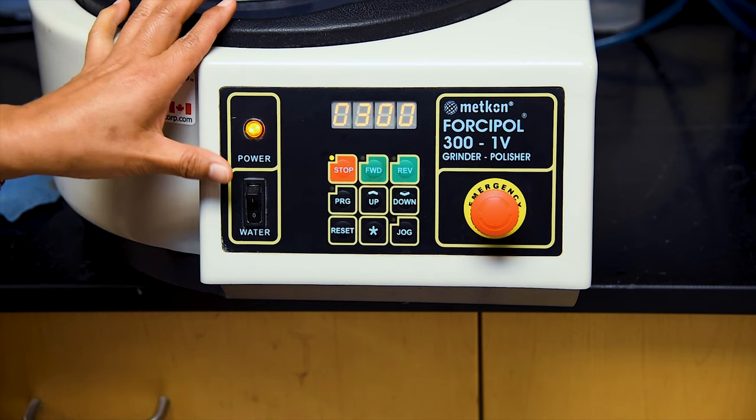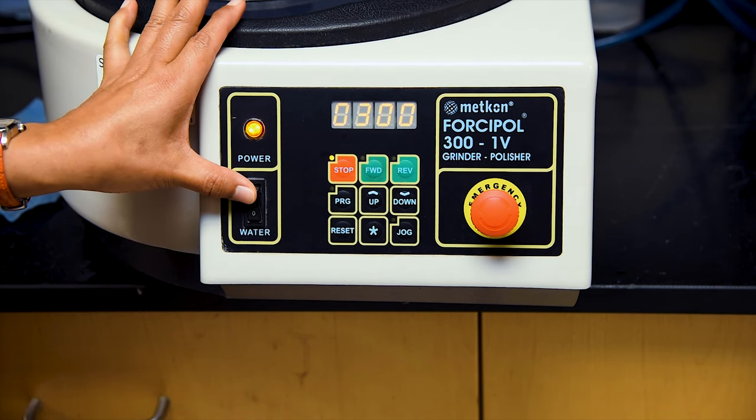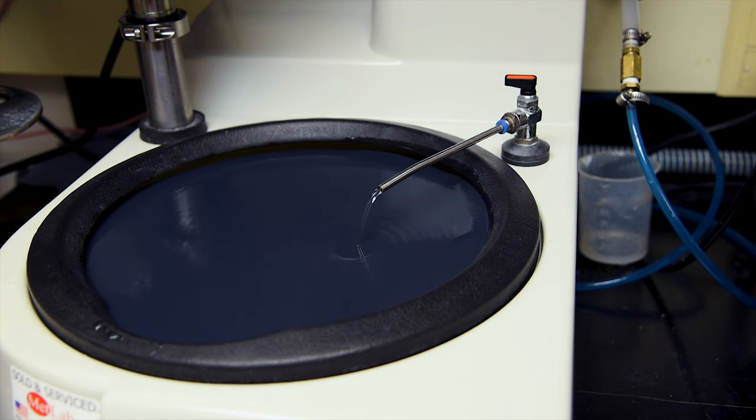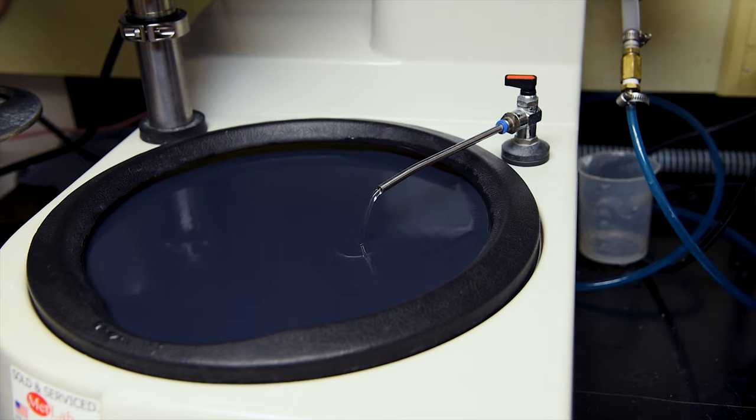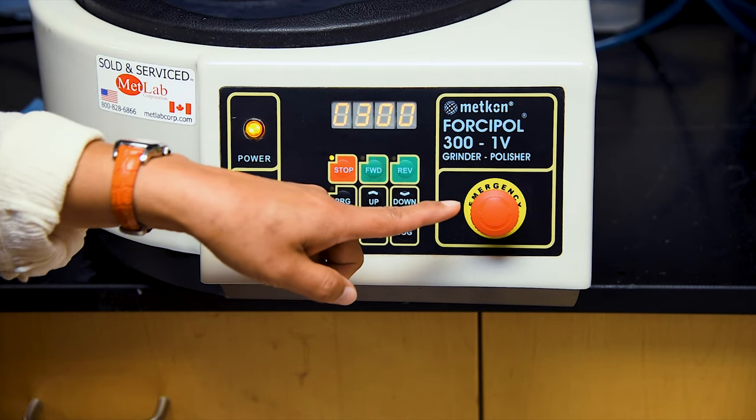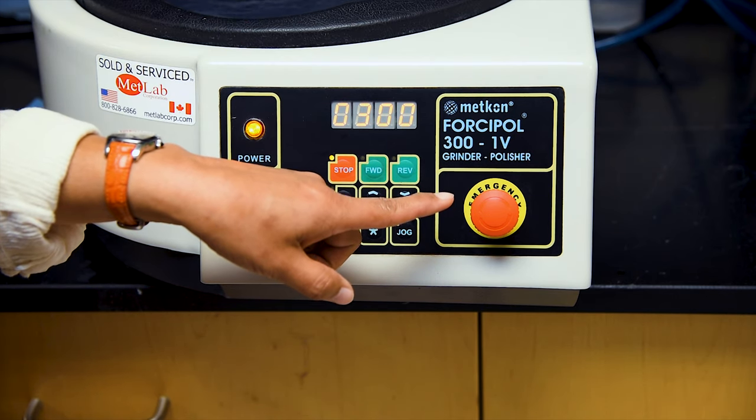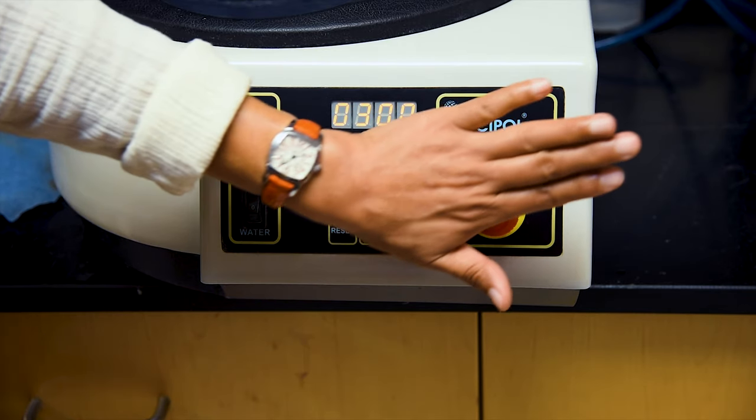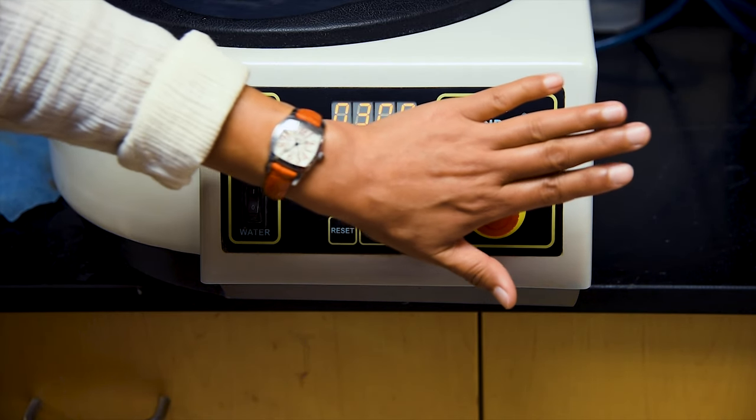As with the trim saw, our coolant and lubricant is water, started by flipping the water switch into the on position, and in the event that something should go wrong and you need to immediately stop the equipment, an emergency shutdown button is readily available to bring the operation to a halt.